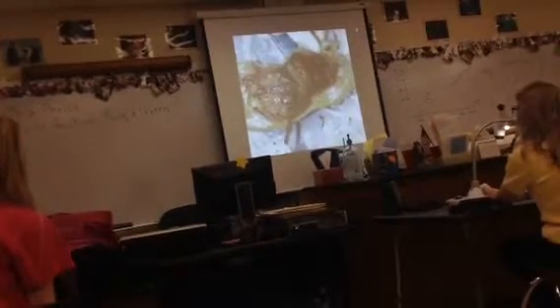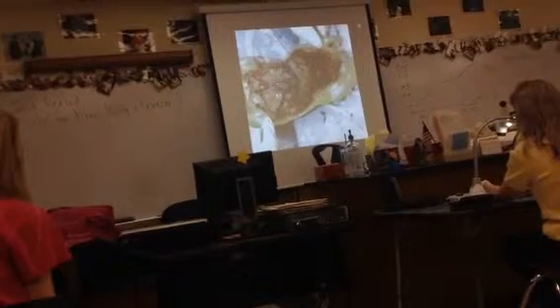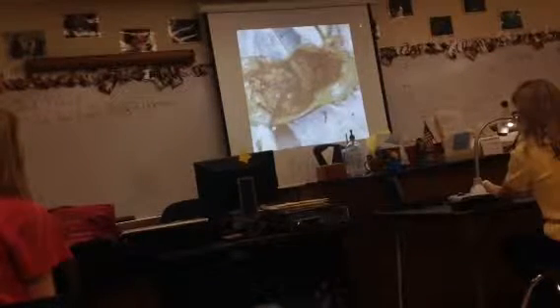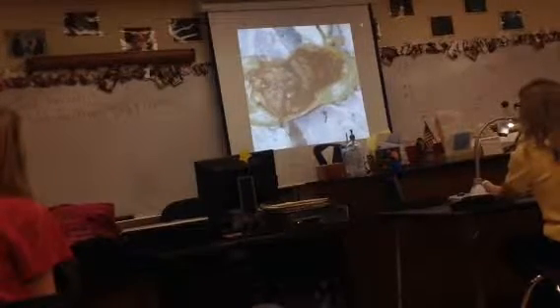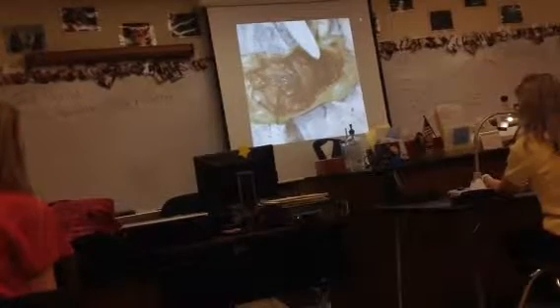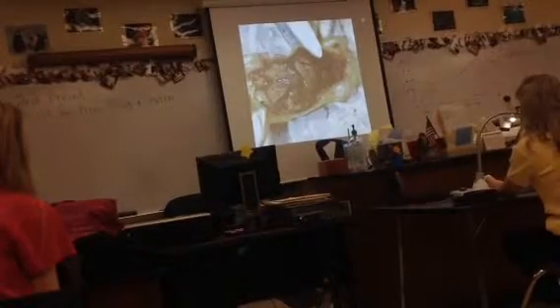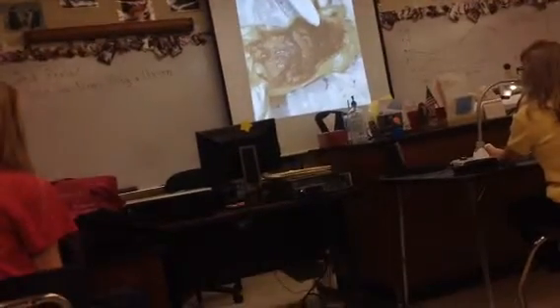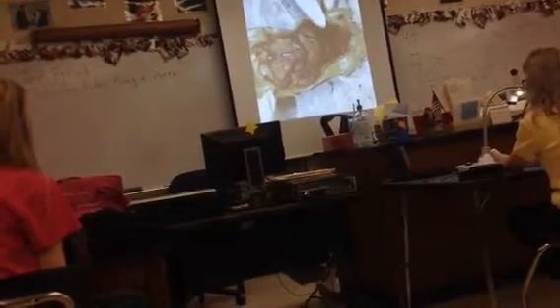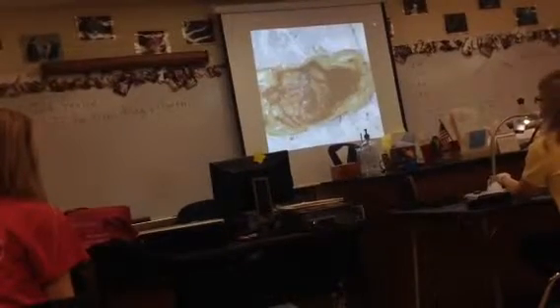All right, then what is this? Kidney. What is this blue? Renal vein. Nope. Vena cava. Inferior vena cava. And the pink, something artery. The abdominal aorta. What's the blue right here going into the kidney? Renal vein. What's the pink going into the kidney? Renal artery. What does renal mean? Kidney.